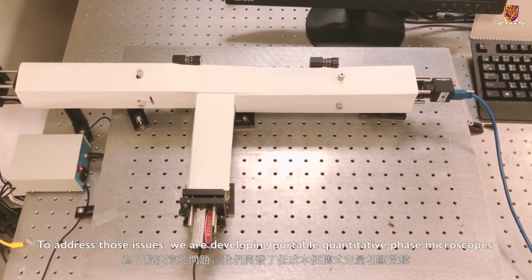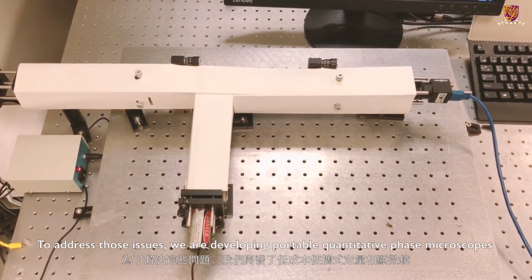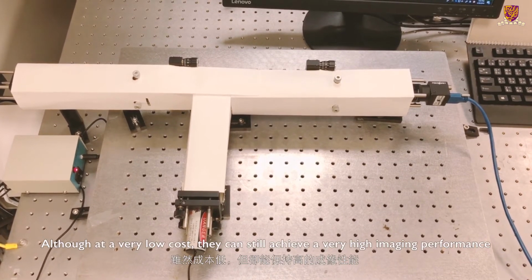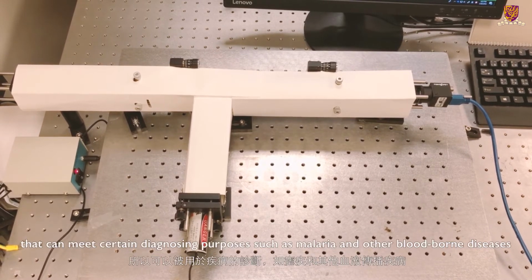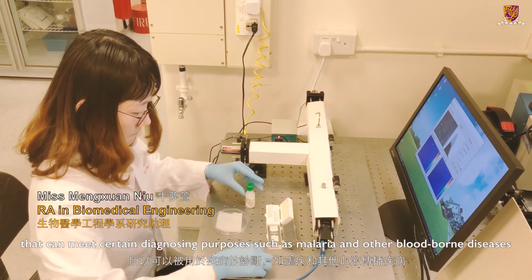To address those issues, we are developing portable quantitative phase microscopes. Although at a very low cost, they can still achieve a very high imaging performance that can meet certain diagnosing purposes, such as malaria and other blood-borne diseases.